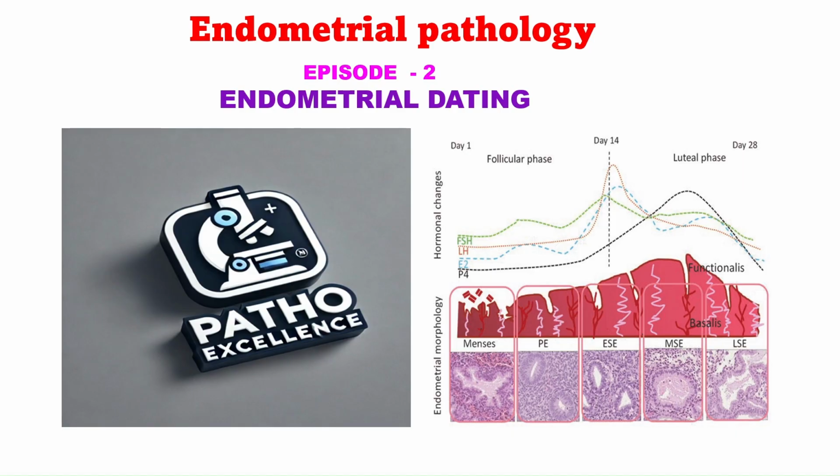Today, let's break down the key histological changes step by step so that you can confidently date an endometrial biopsy in your exam as well as in clinical practice.